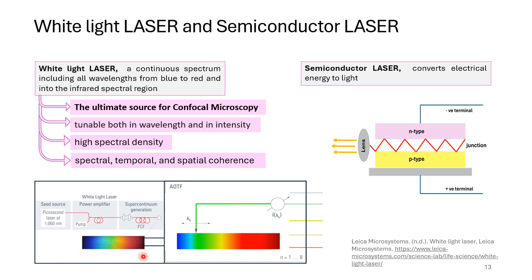Next, it is connected to a tunable filter which selects a single light of this broad spectrum, and then it falls upon the sample. Due to this unique combination, the white light laser is very useful as it has high tunability and provides a broad range of excitation sources.